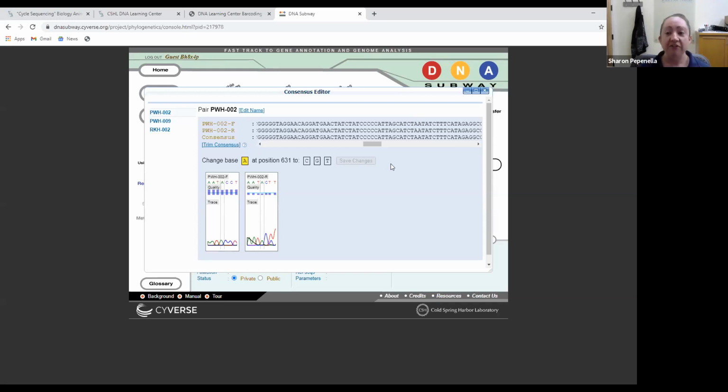Why is it bad to have a short DNA sequence? Well, for example, if you were to have a DNA sequence that's just ATTA, and we compared it to a database of thousands or millions of DNA sequences, how many sequences do you think would come back with the result of ATTA in it? Plenty. And the probability of the first result that comes back in fact being your sequence is really, really low. So the larger your sequence, the higher the probability that the results given back to you are in fact a close match to your species or an identical match to your DNA sequence of your species.